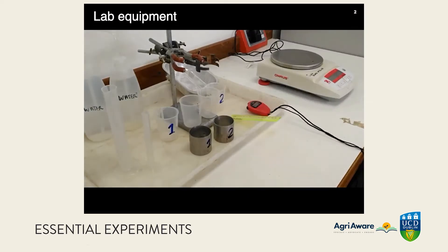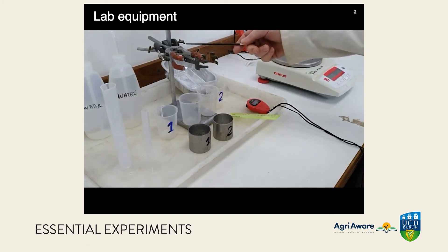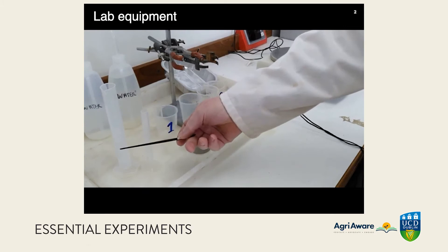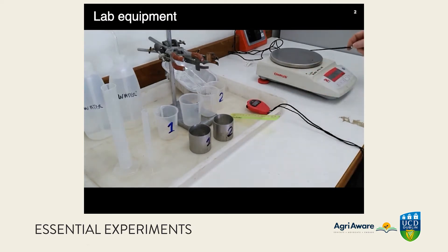Here's the equipment: two soil sampling steel rings, some beakers, a stand with clamps, water — ordinary tap water is fine — graduated cylinders for measuring volumes, some trays for handling soil material, a ruler, a timer, and a benchtop balance.